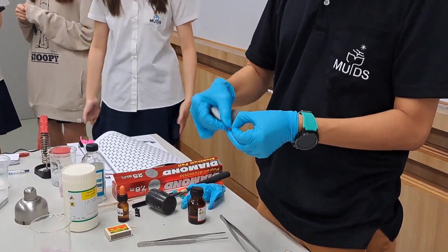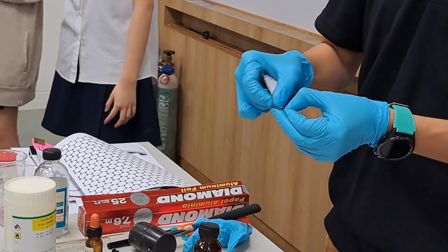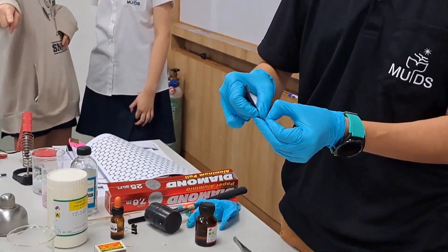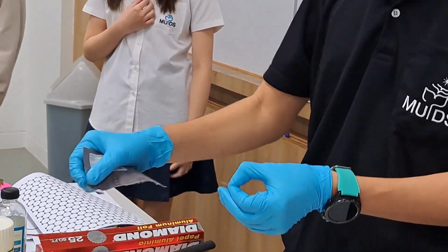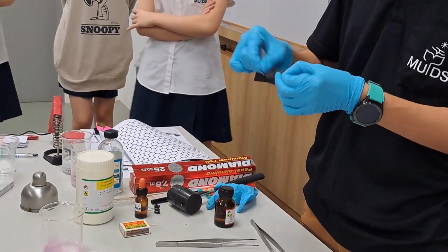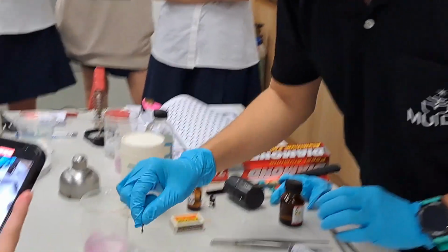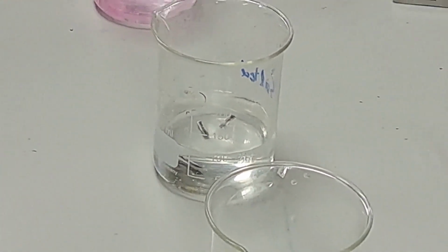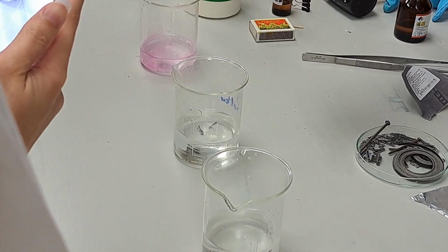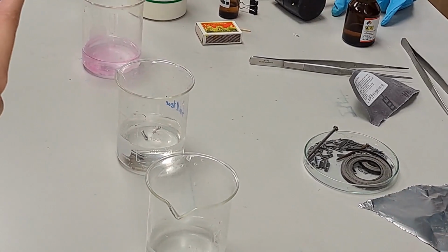Alright, and let's activate one more piece. So it has the coating because they want to protect the metal. This is kind of reactive, but not as reactive as sodium. Okay, so I will drop one more piece of magnesium in there. Alright, it's somewhat floating, and it's because of the surface tension. If you push that, it's going to sink. But let it float. It's easier to observe when it floats.